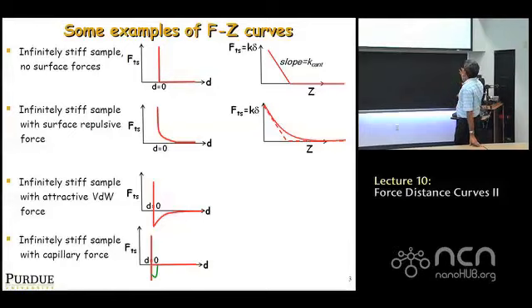So what is happening is, of course, when you're way over to the right, when Z is large enough, there's no interaction force because your gap, your separation, is pretty high, right? As you come close to the sample, you see there's a gentle increase in interaction force. There's a gentle curve that comes in.